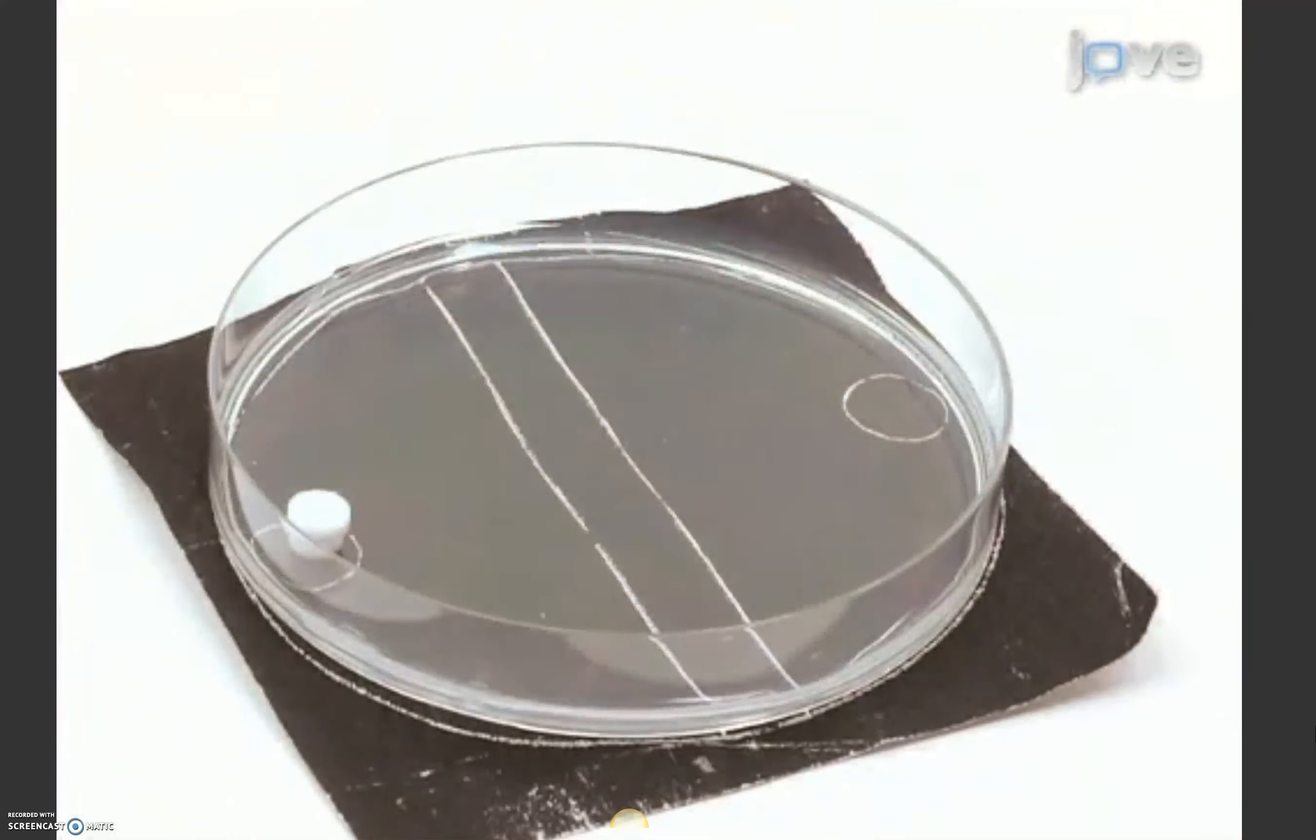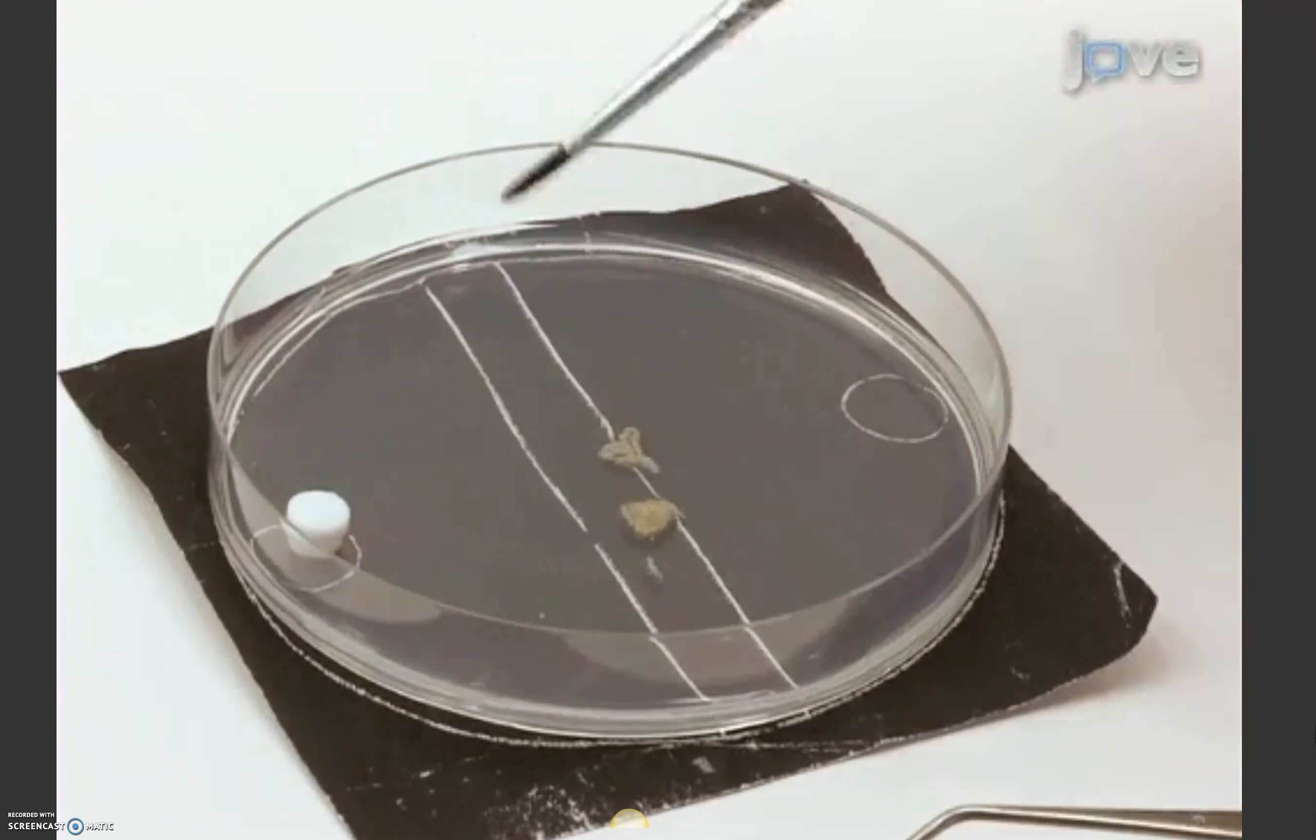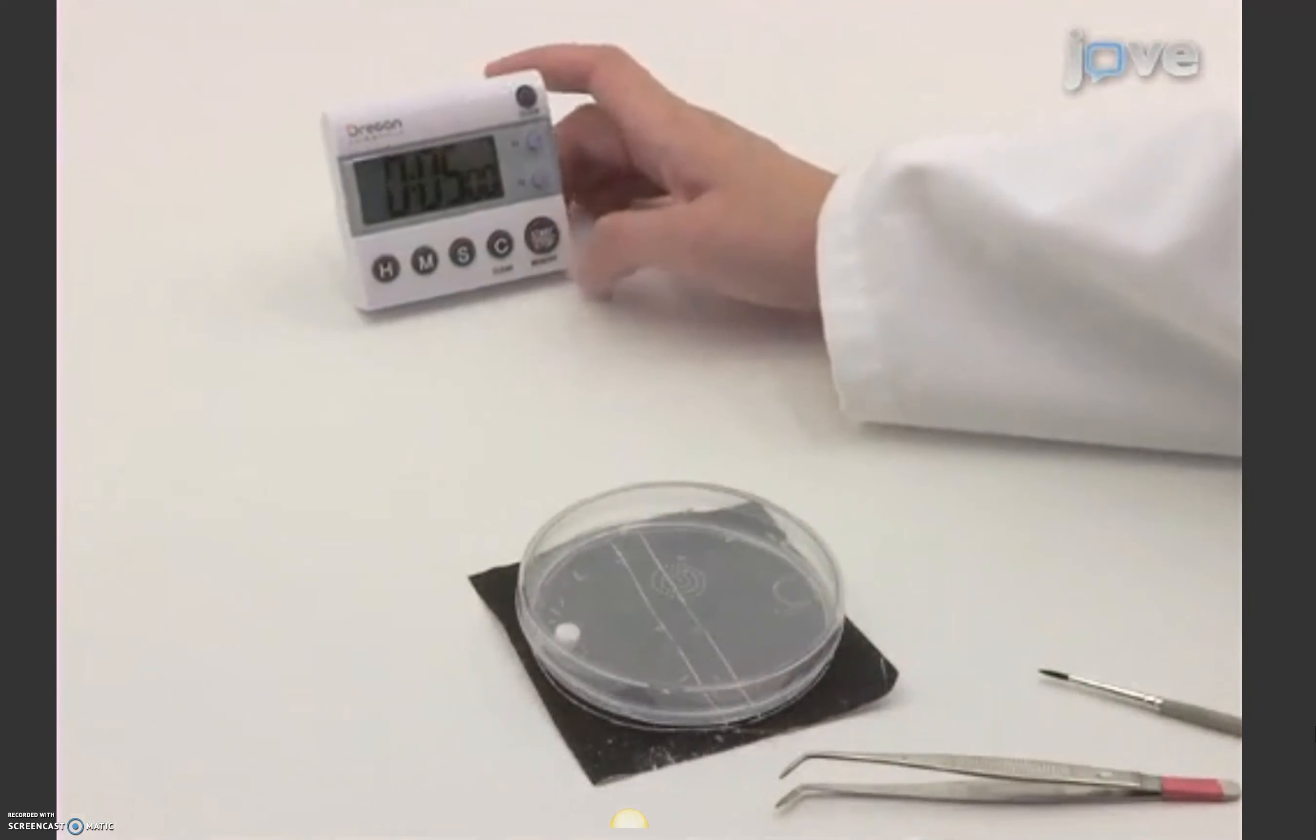Next, load the larvae onto an agarose petri dish with just one stimuli vial on one side. Close the lid and wait for 5 minutes.